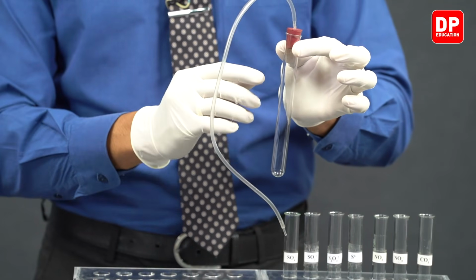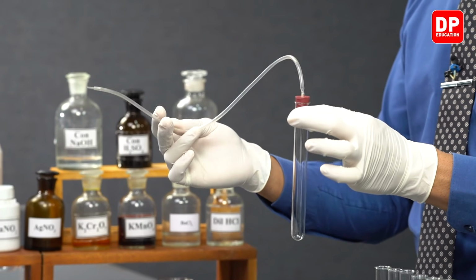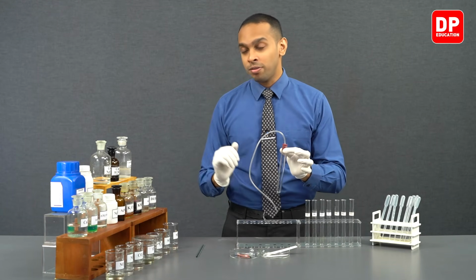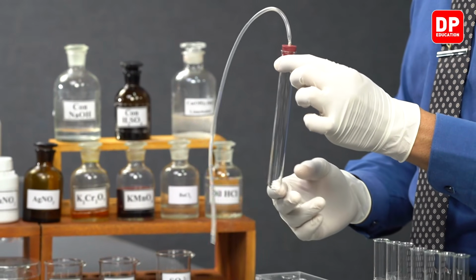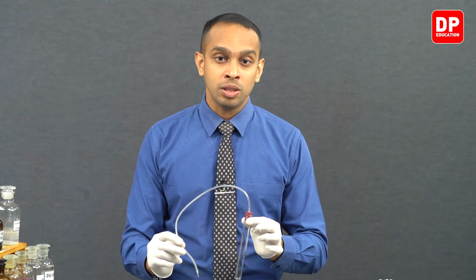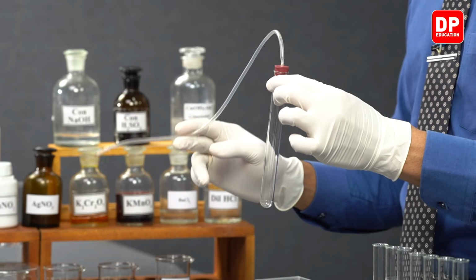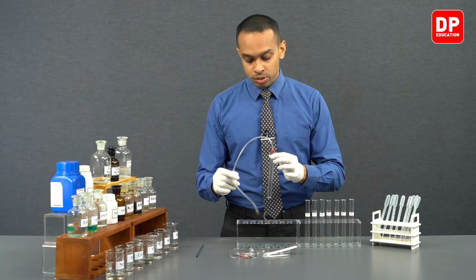So we can use this setup to deliver the carbon dioxide with the help of this delivery tube into lime water. We'll be doing this when we are testing for carbon dioxide with the use of lime water. So this setup is used to deliver a produced gas to a specific solution or to a specific chemical species.